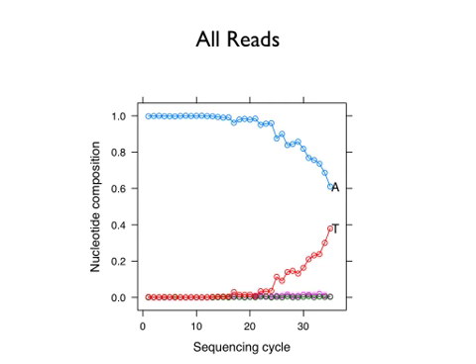So what is this plot showing us? On the x-axis it's the cycle. On the y-axis it's the proportion of A's, actually, the proportions of A's, T's, C's, and G's. So notice that we get very few C's and G's. So you see how they're all mostly at 0?